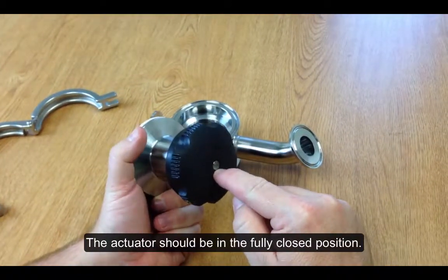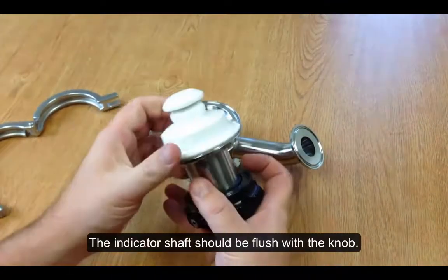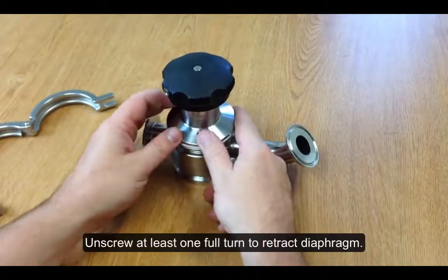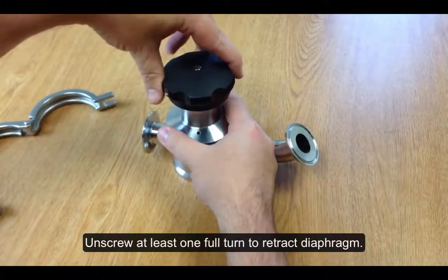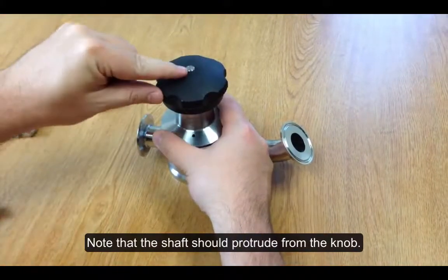Verify that the actuator is in the fully closed position when the diaphragm is first installed. Then you'll insert the diaphragm and actuator back into the valve body, and then you'll retract the diaphragm a little bit until the shaft protrudes some.